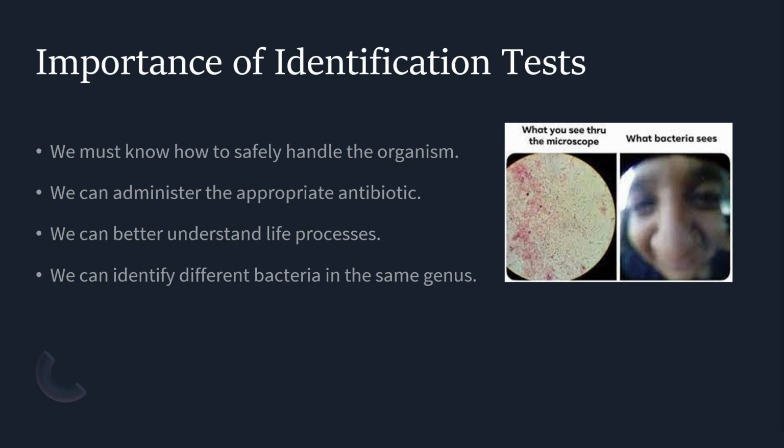We know that E. coli has been very generous in allowing us to study it. And we can identify different bacteria in the same genus, like different types of Clostridiums or other bacteria that can be found in different places.